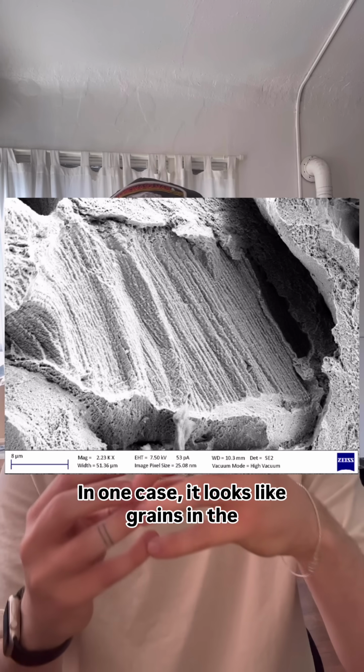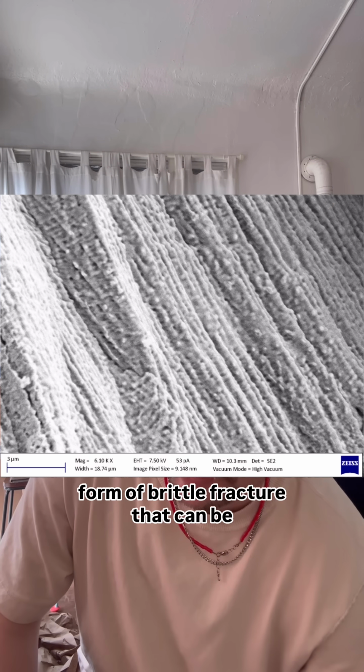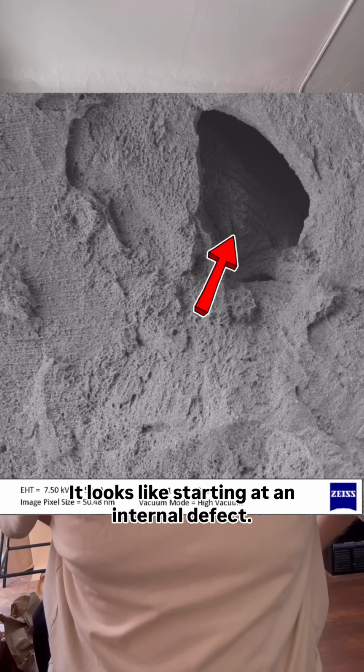In one case, it looks like grains in the metal separated from each other, a form of brittle fracture that can be sudden, and there was a crack that grew outward. It looks like starting at an internal defect.